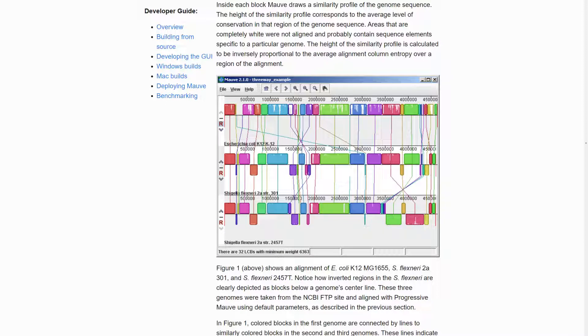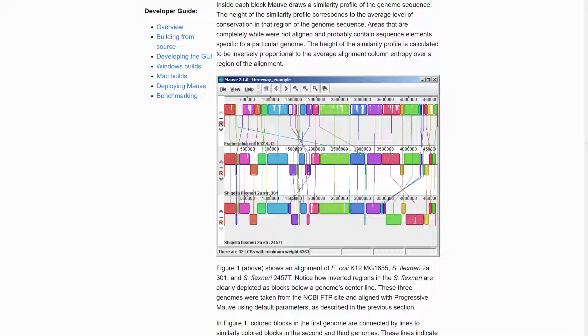Each colored block represents a region of sequence that aligns to part of another genome and is presumably homologous and free from internal rearrangements. These are called locally collinear blocks, or LCBs.